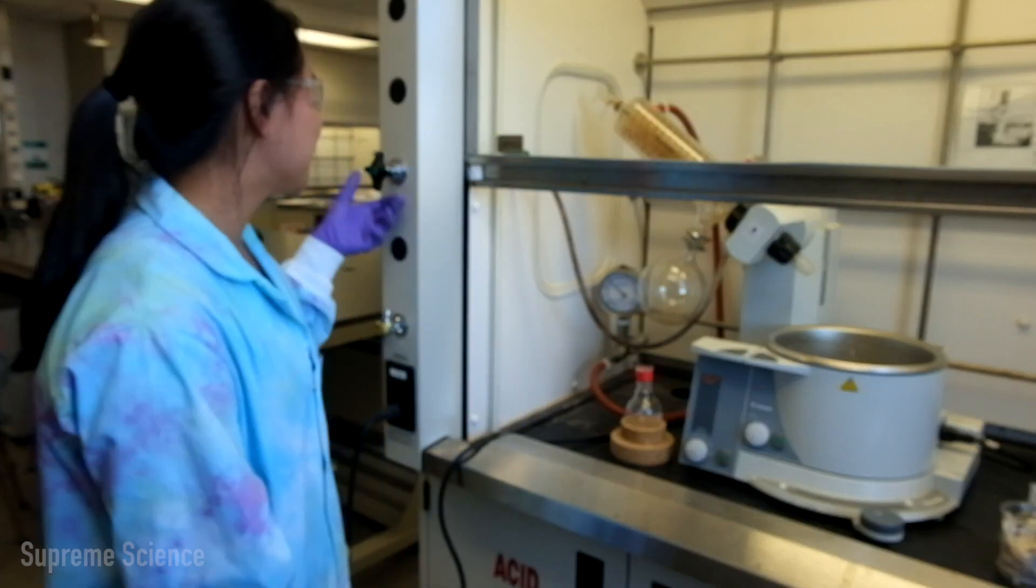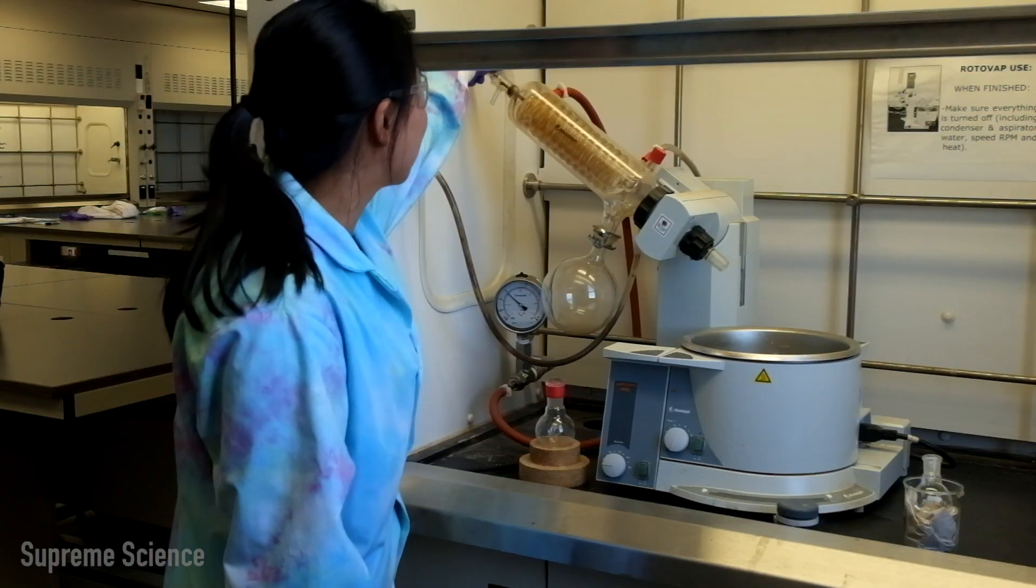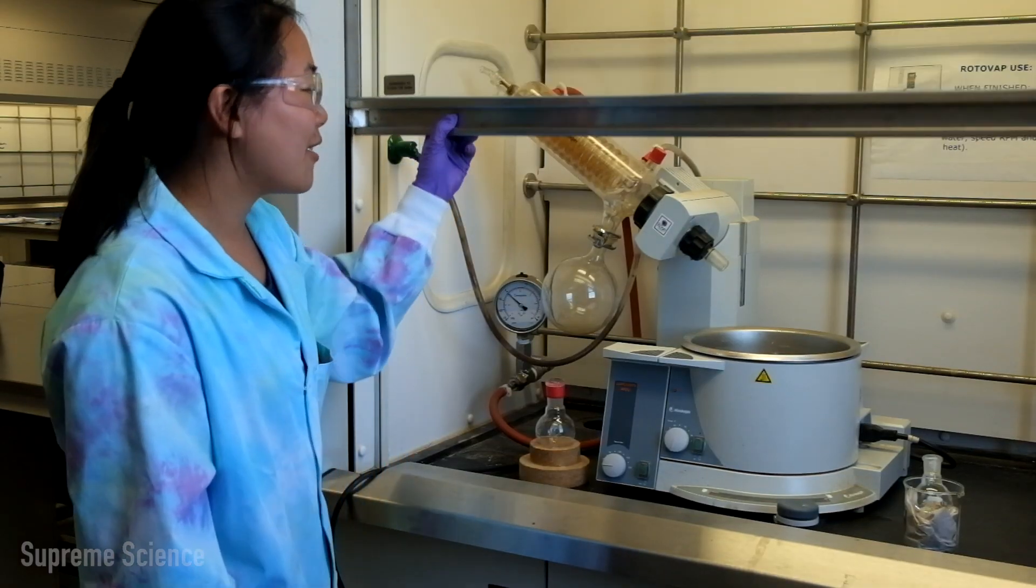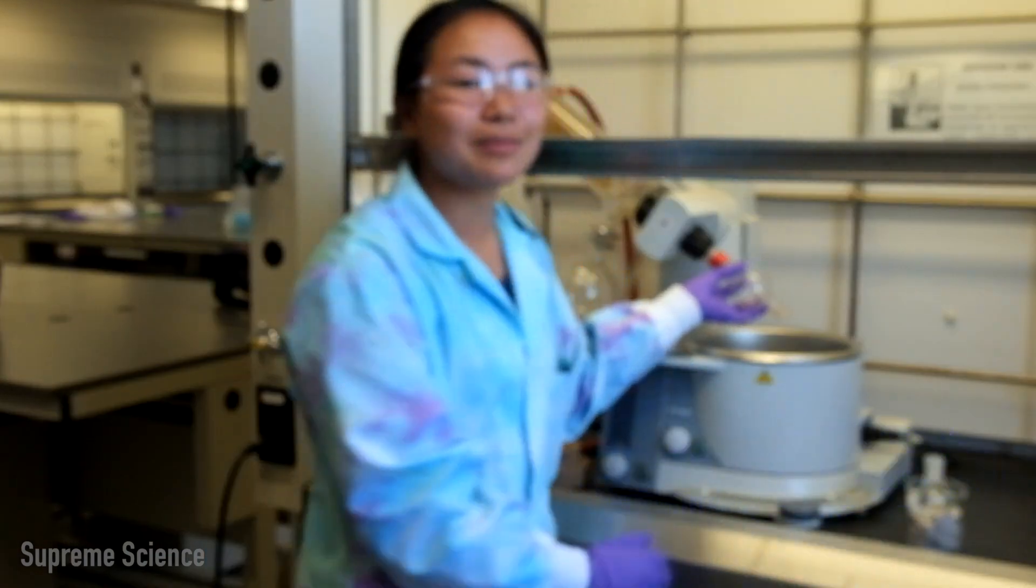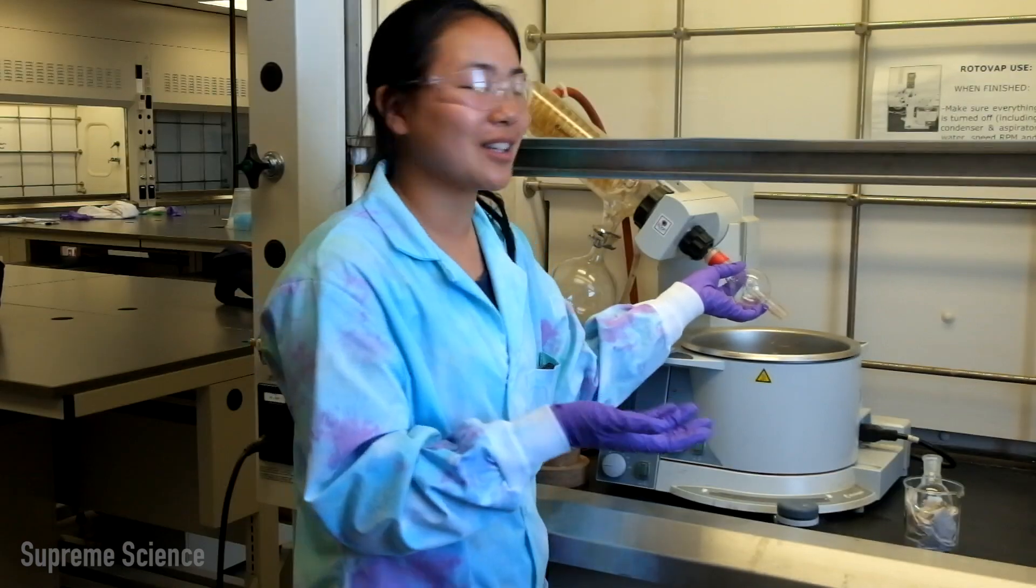The first thing you want to do is turn your cold water on gently. Close your stopcock at the top of the condenser. And then you can take your splash trap and put it here. And you want to hold it because there's nothing keeping it there right now.